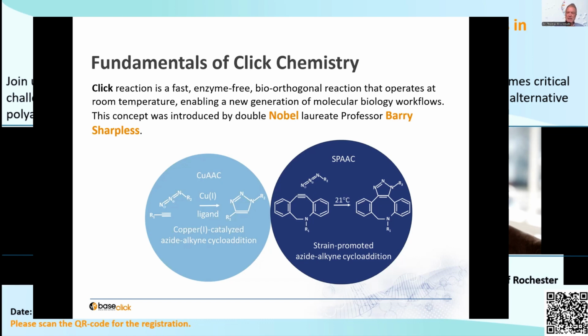He introduced the copper-mediated click reaction, which is depicted here on the left side.